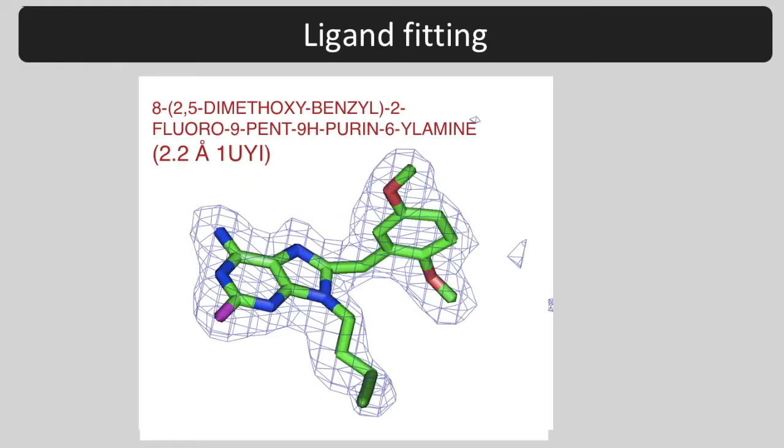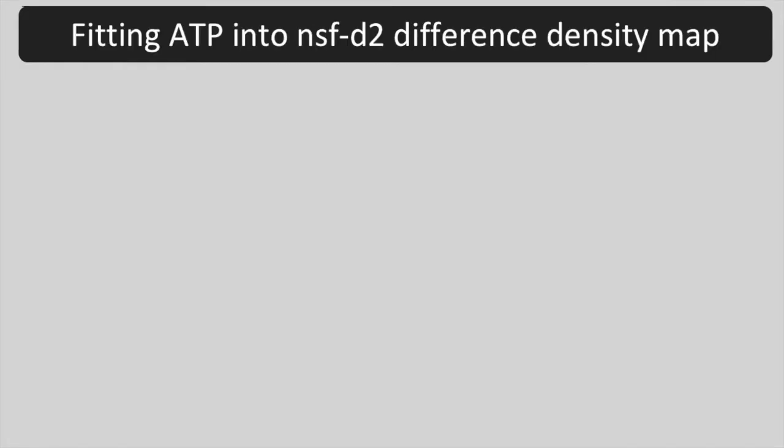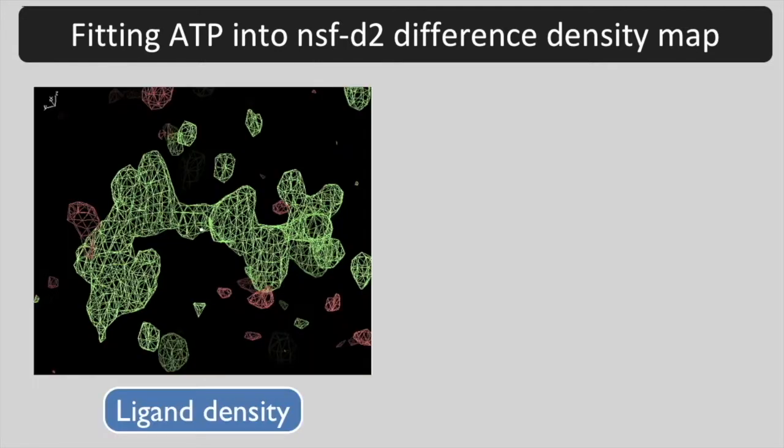At moderately high resolution, such as two angstroms, you see the conformation fairly clearly. We are going to use Phoenix tutorial data on the NSF D2 protein, which we know has ATP bound.